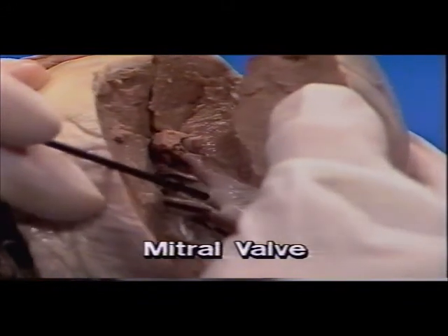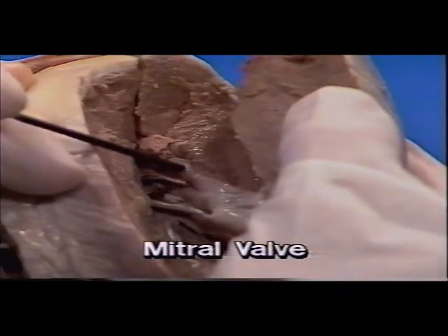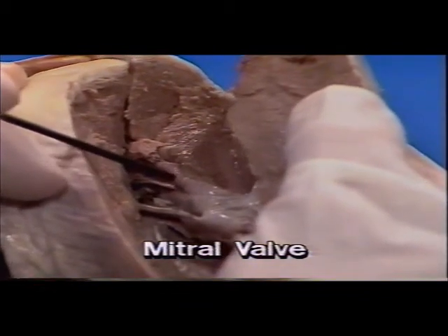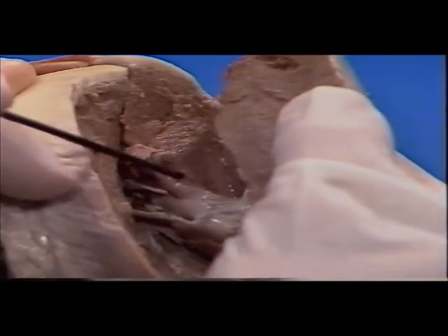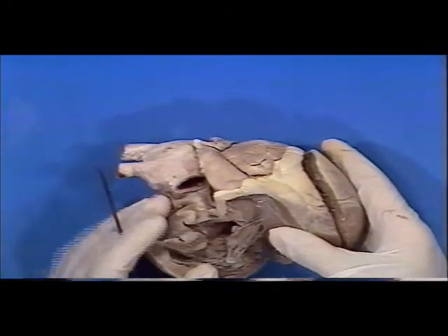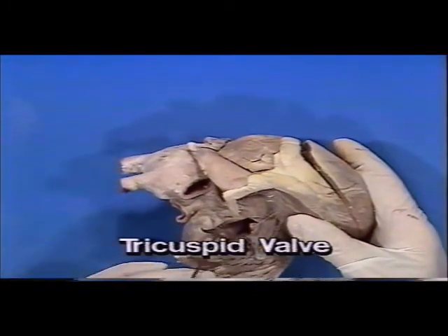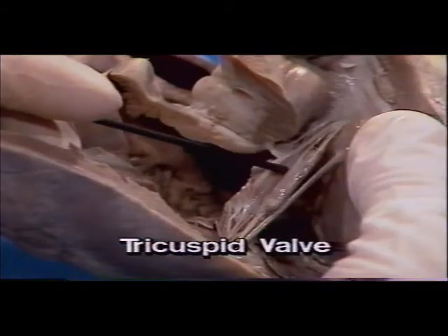This valve is also called the mitral valve because the valve resembles the two-part hat that bishops sometimes wear, called a mitre. The right atrioventricular valve, seen here, is called the tricuspid valve because it has 3 points.